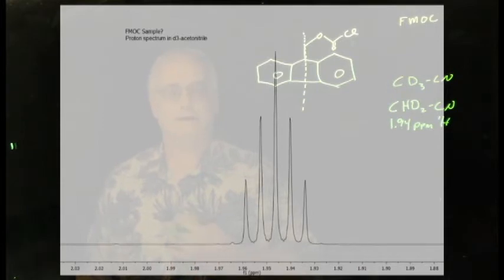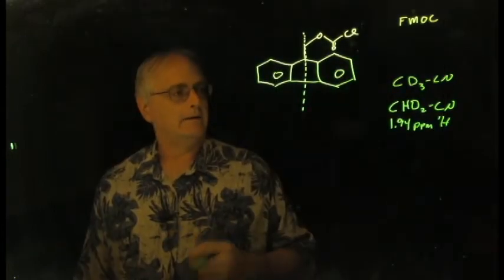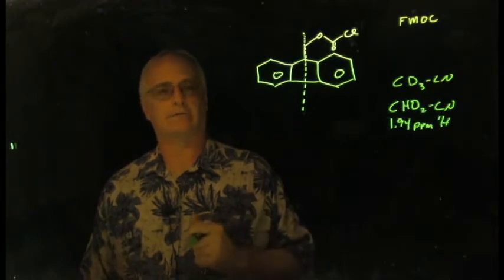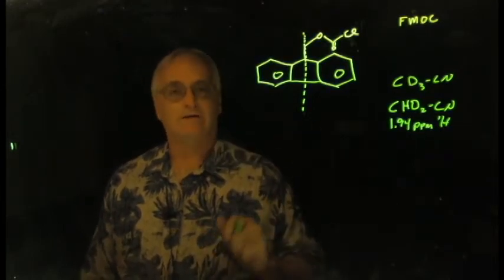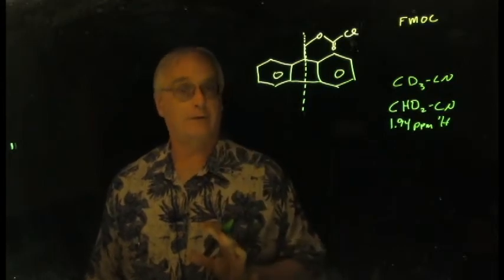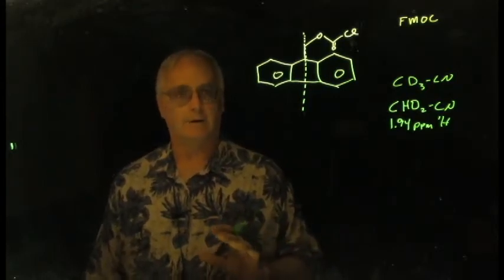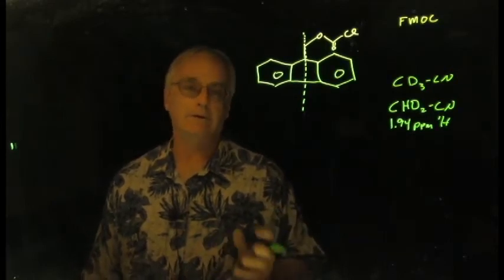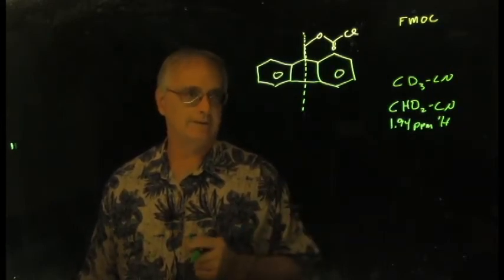I look at that and I just get all happy inside when I see it. Why would that hydrogen be a pentet? Well, that's a question for another day. But we see it in the spectrum, so when we see this little peak in our FMOC spectrum, we do not look at it and go, oh my gosh, my sample has something down here at 1.94. No, it's your residual solvent peak.